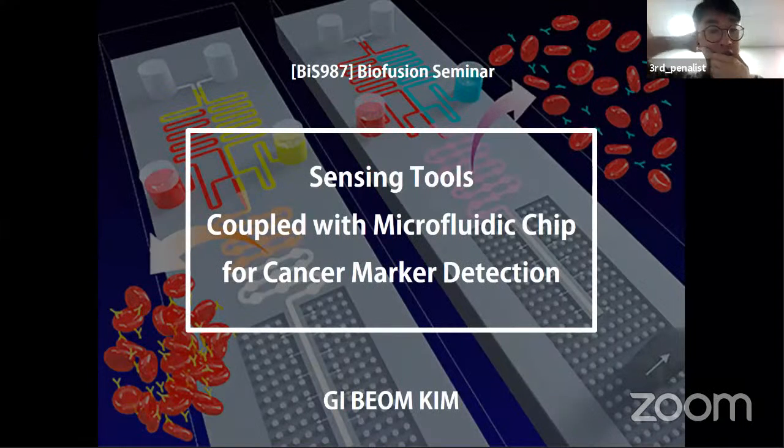Hello, I'm Gibom Kim, third presenter from Biophotonics Lab, Giunjung Professor. I'm going to share with you about sensing tools coupled with microfluidic chip for cancer marker detection. These days, on-site diagnosis for quick diagnosis is drawing attention, and rapid cancer diagnosis is an important way to prevent cancer from worsening.